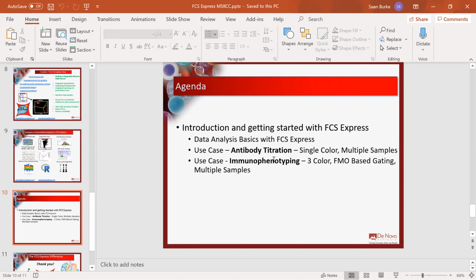And in most cases, people are going to be using the second workflow that we showed. More often than not, folks are not doing a one-off, comparing a few different data files to each other. I like to call those suck it and see experiments, right? We just do something real quick to see what happens, see what's going on. That's when you use that first workflow. But when you're starting to do a more in-depth analysis, you're going to be doing experiment repeats, daily, weekly, something like that. You're going to want to graduate into the immunophenotyping workflow.